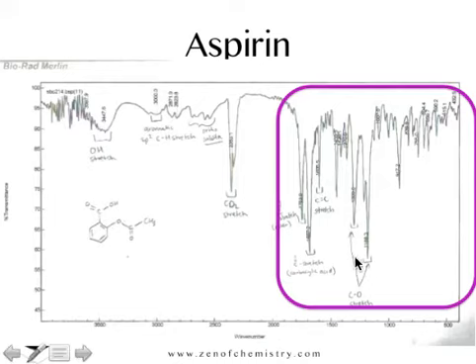I've picked out a few others there. I'm not going to focus in on them today, but definitely if you've got an infrared spectrum and you have a look at your table, and you may or may not know what your molecule is, you can match up those wave numbers to particular parts of your molecule. That's essentially where I'm going to leave infrared spectroscopy for the purposes of this video.